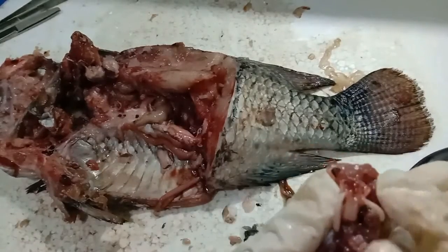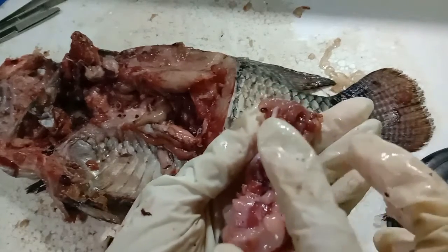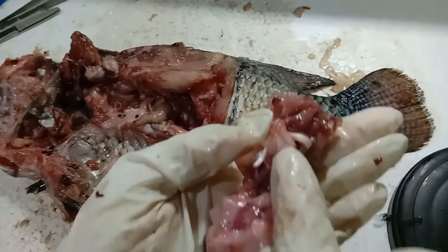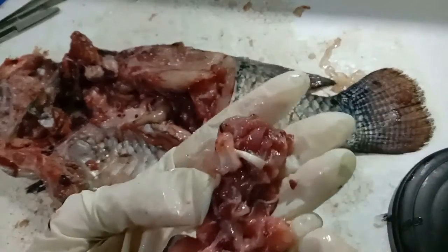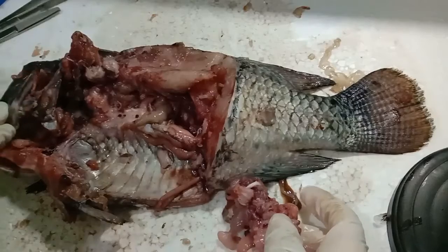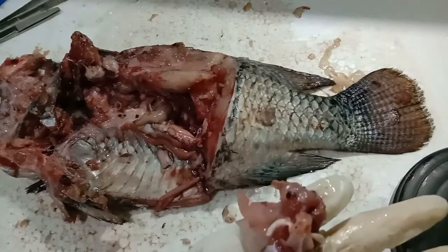But I found it. These are the nerves that attach to the brain. This is the nerves that attach to the brain. This white. And these are the eyes. And actually there are olfactory nerves here, but I can't find them. It must be up here.